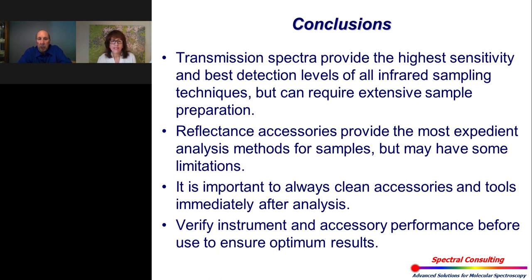That's kind of similar to the one I talked about earlier. A lot of times we remove the accessory from the instrument, and we make sure that the instrument's working properly. A lot of times we can monitor the energy or the interferogram energy. There's ways to do that in your instrument, and a lot of times we just have to dig out the manual and look at that.